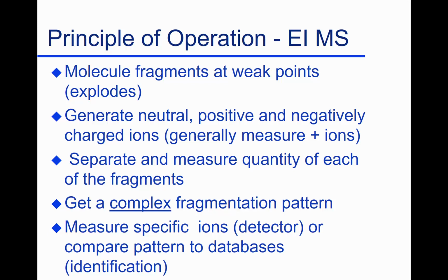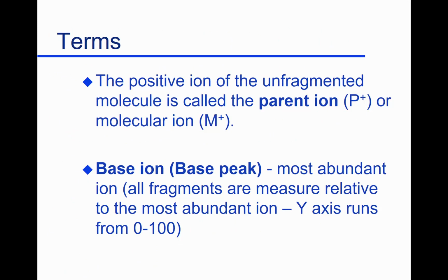What molecules in the library will match the pieces I find of the molecule I was looking at? We can then typically get an identification. Not always, but a lot of compounds have been identified. There's an awful lot of compounds in these libraries, several 100,000 compounds. So we've got a really good opportunity to do this kind of matching.